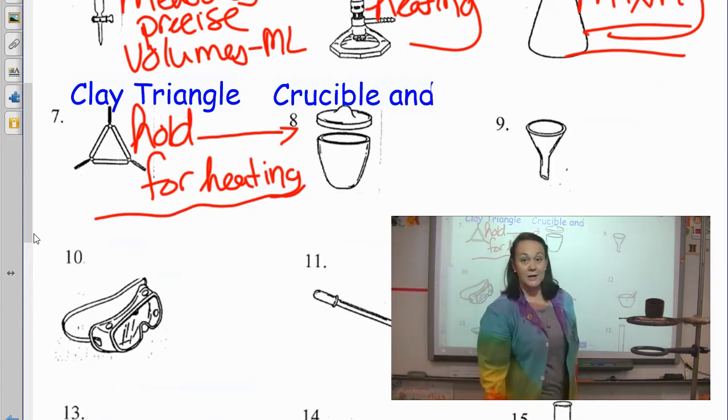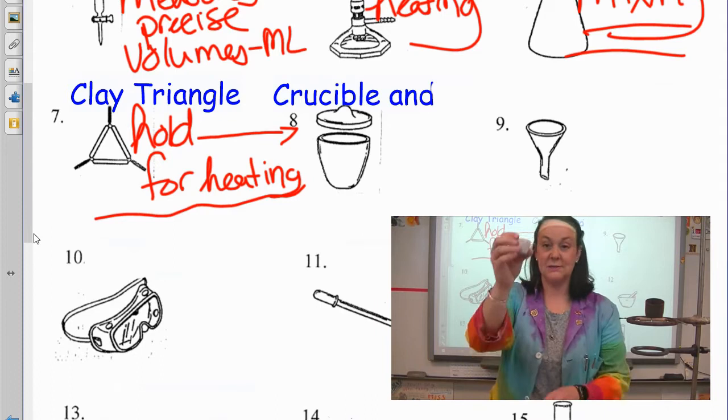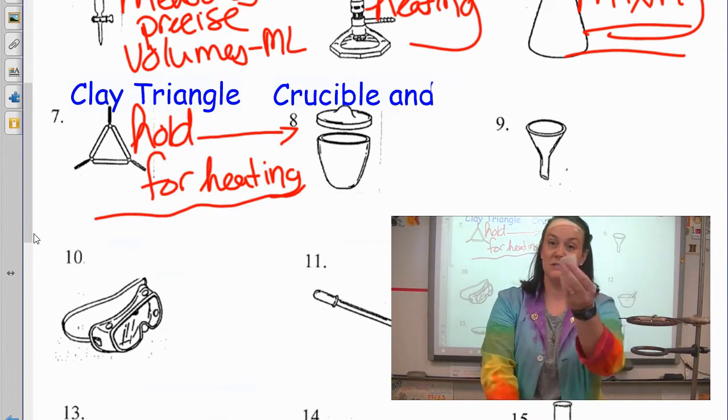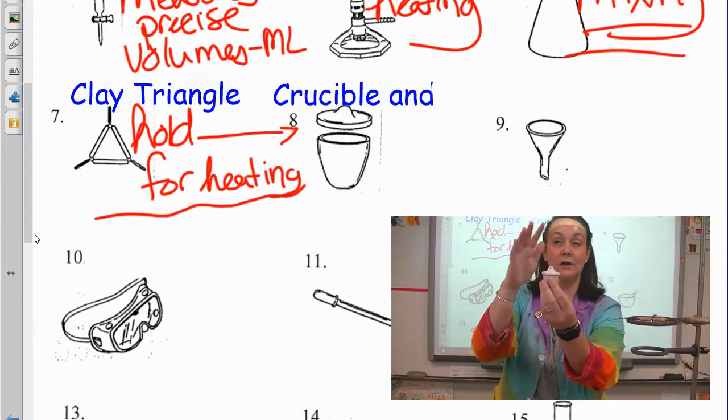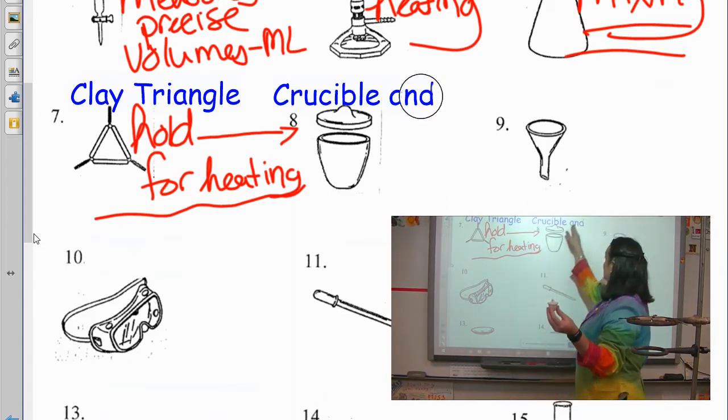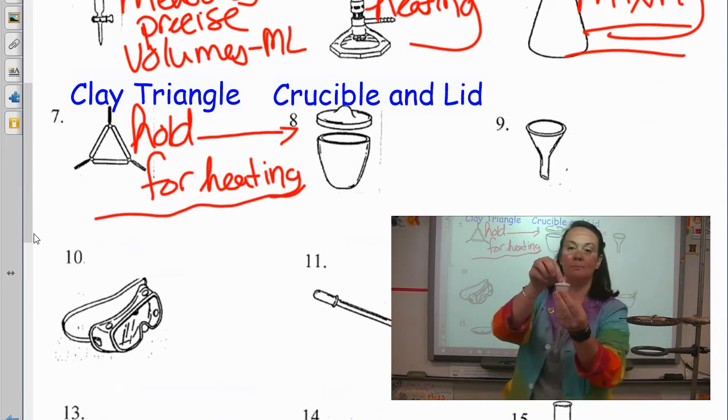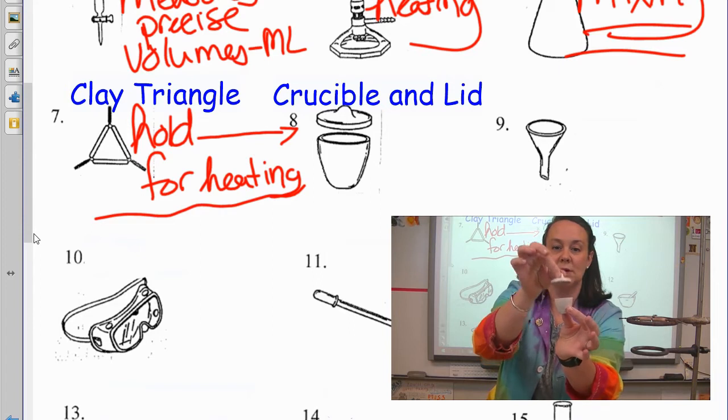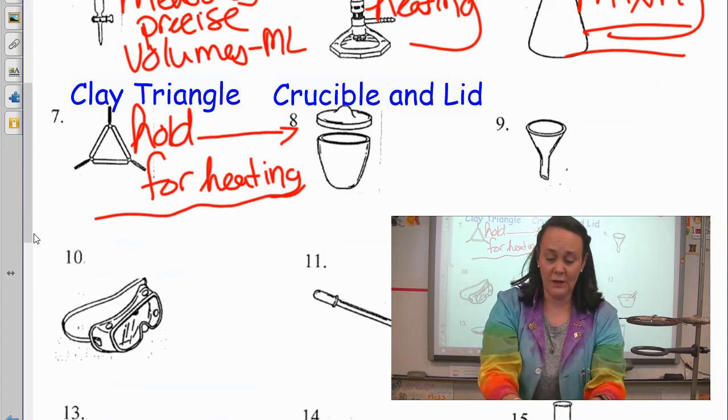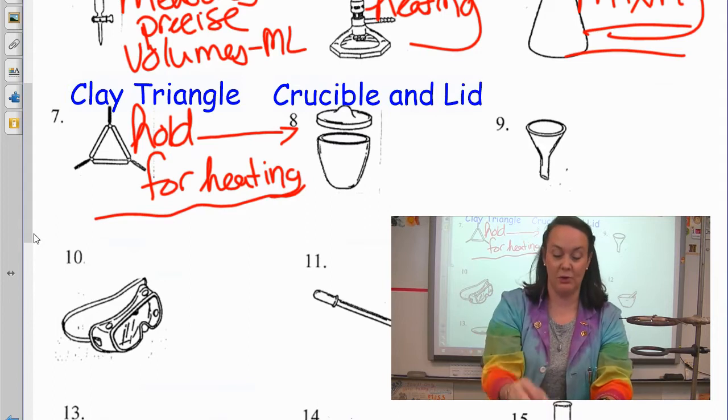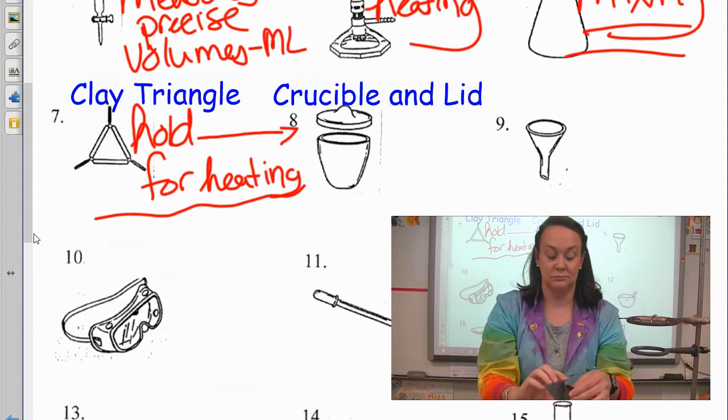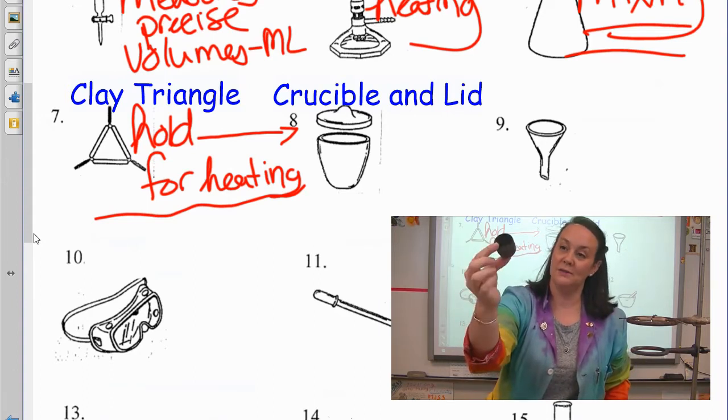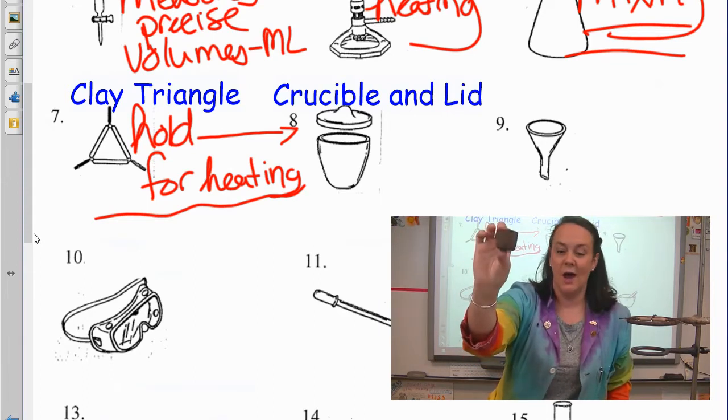And now you're probably like, it's crucible and wood. Well, the nice thing is sometimes we use metal crucibles that don't come with lids, and sometimes we need to retain some heat, so crucibles can come with lids. So crucible and lid. Crucible, it's like a teeny tiny little heating apparatus. They come in ceramic persuasion, which is extremely breakable. So we try to use those only when necessary. And then we have an iron one that, while it's rusted and doesn't look very nice, they're very durable.